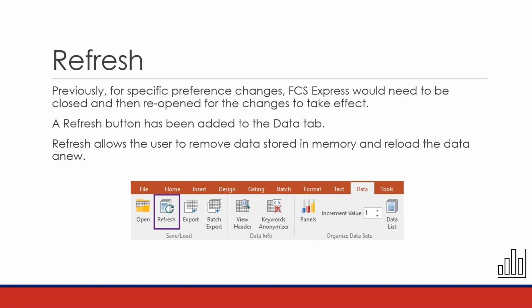So in our latest release of FCS Express, we've included the ability to basically refresh our data. And what that means is that there are certain preferences in FCS Express where those preferences only kick in when you load in new data. Okay, so what we've done is we've actually gotten rid of that, because it's kind of annoying if you have a layout and you load data in, and maybe, for example, the axes labels aren't what you want them to be just because you forgot to select a preference ahead of time.